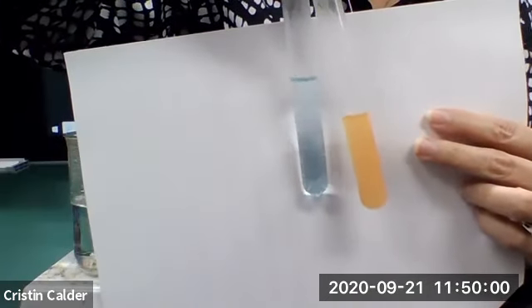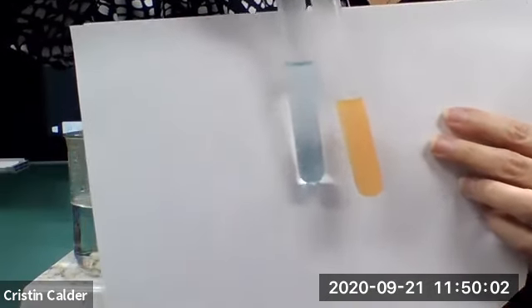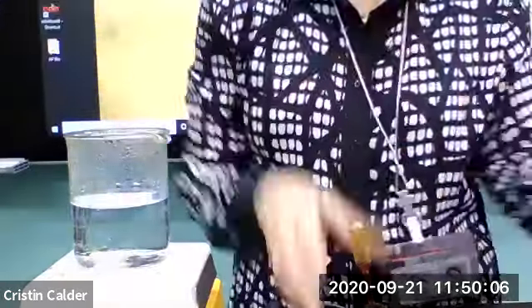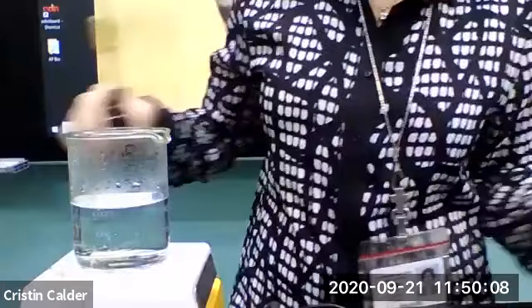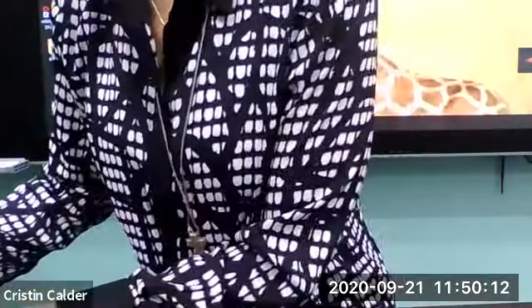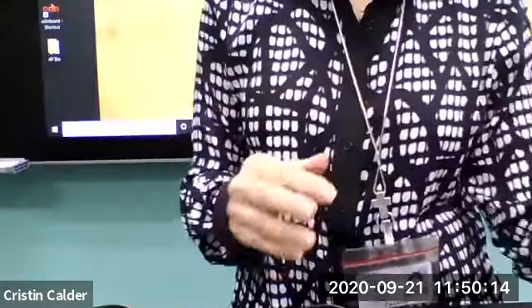It can actually turn anywhere between a yellow to an orange to even a deep red color. All of those would be a positive test for sugar. All right, for my third test, slide this out of the way. My third test is going to be my protein test.